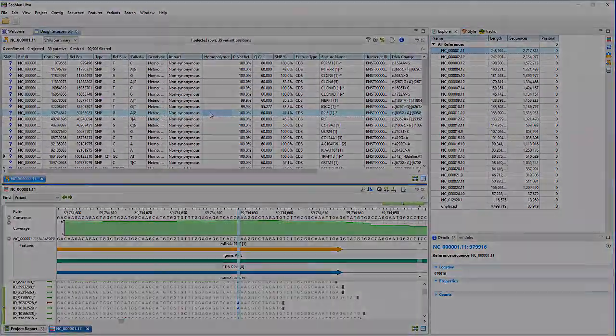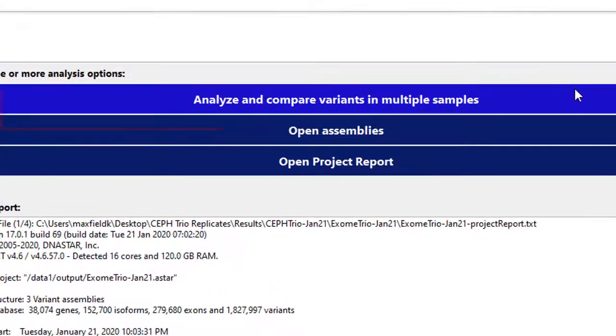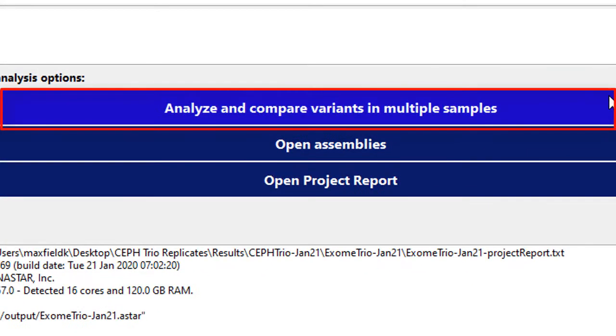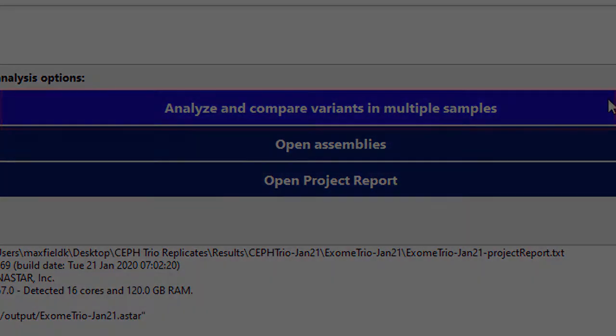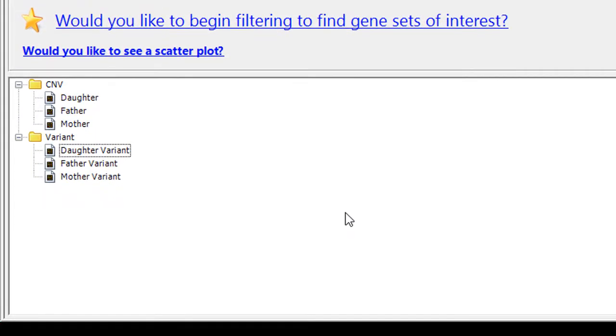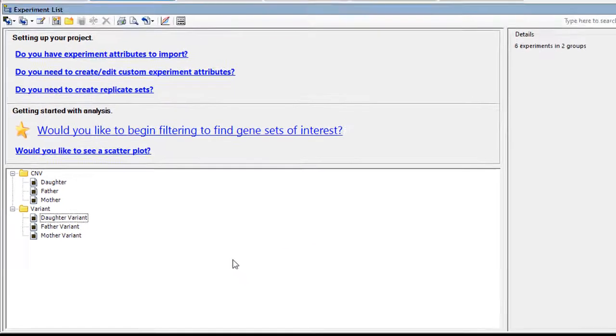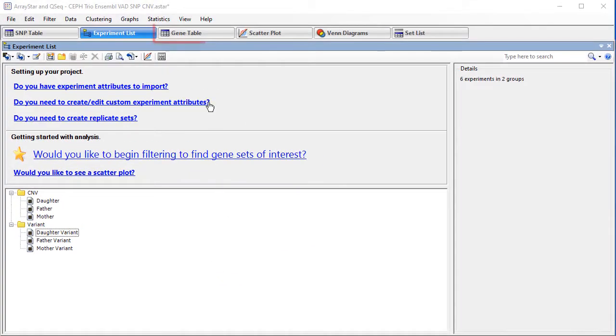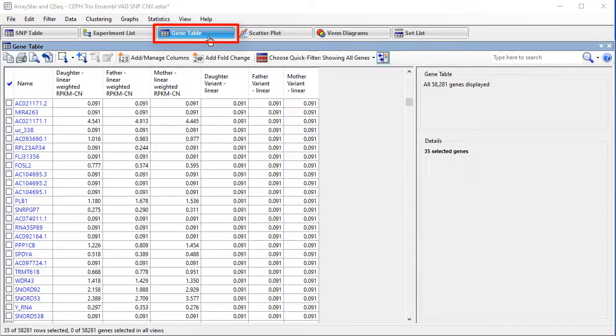For advanced variant analysis, filtering, and comparisons, open the project in ArrayStar. In ArrayStar, you can analyze variants and CNVs for all samples in the project. CNV data will be visible in the gene table, which displays RPKM values.